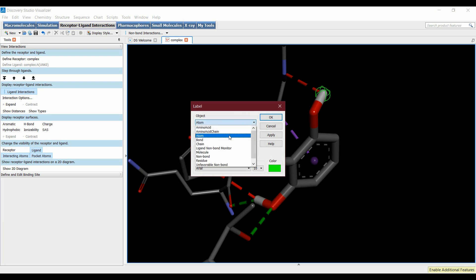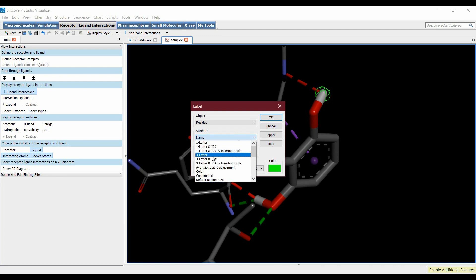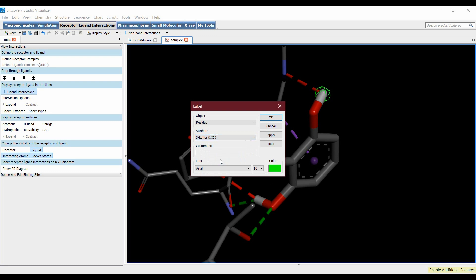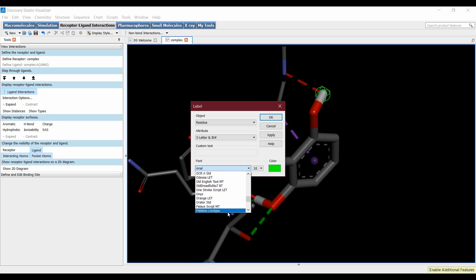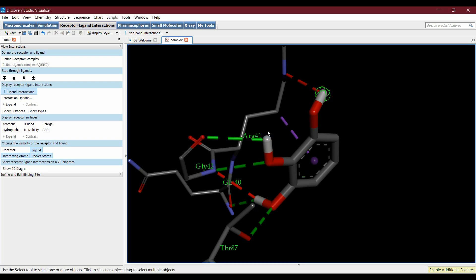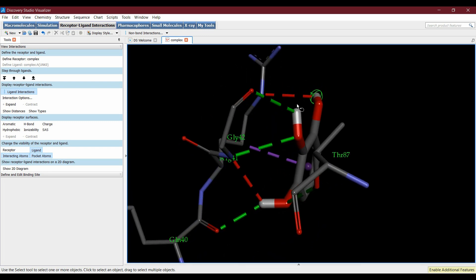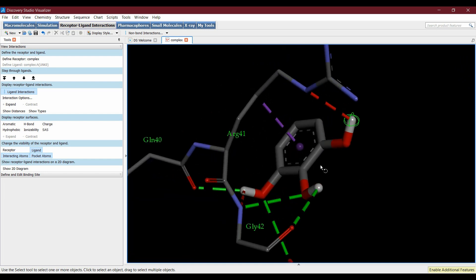To label the interacting residues, right-click > Labels > Add. From Object, select the residues; from Attributes, select 3-letter code and ID — this will show the three-letter residue code and its number. You can also change the font and its size, then click Apply. You can now examine the residues with their IDs and their interactions with the ligand.